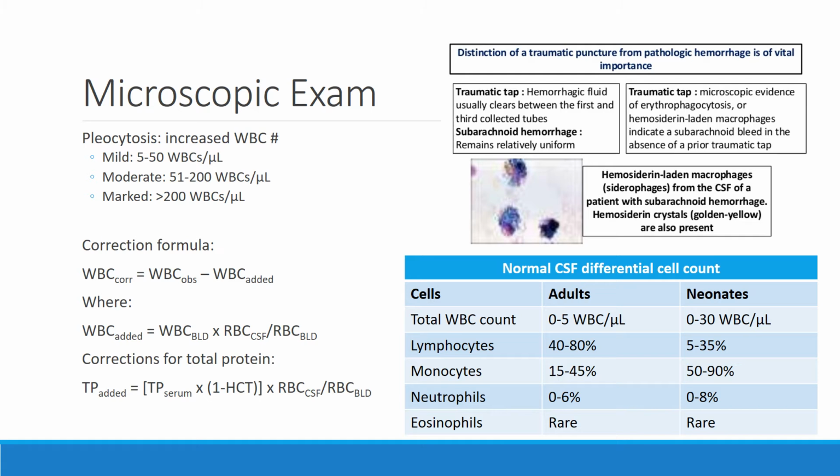Literally, they've done studies within 2 hours. If you've held that specimen for more than 2 hours without doing your microscopic on it, you can see up to 40% of the white cells lyse after 2 hours. So again, getting it to the lab and getting the procedure done right away is important.